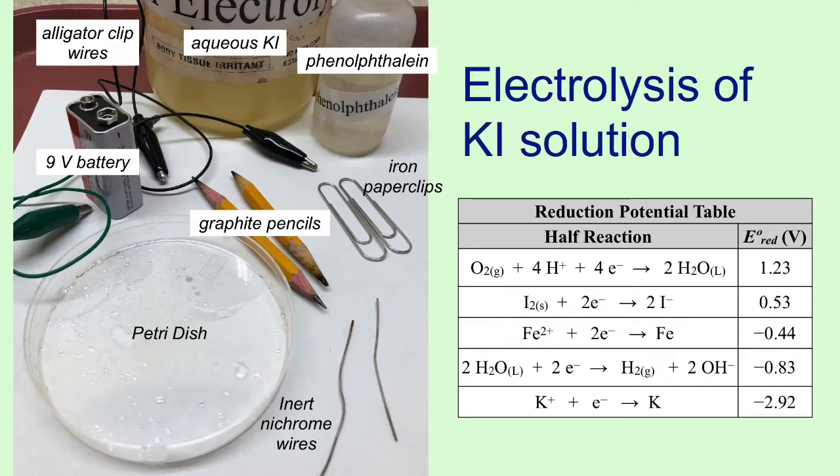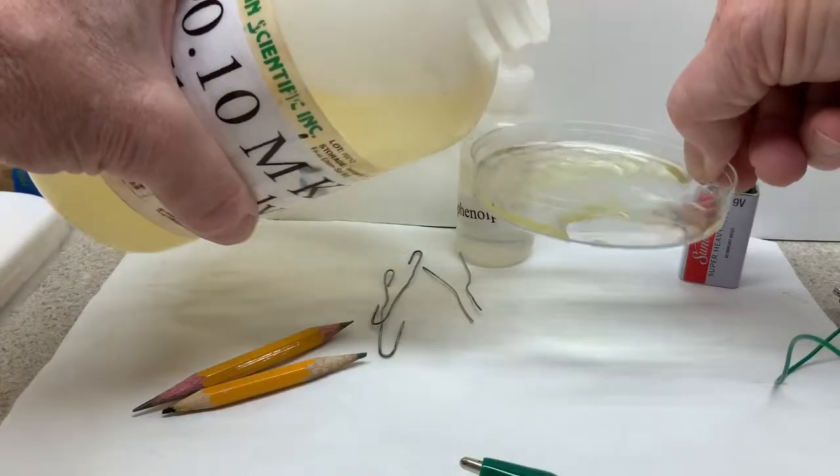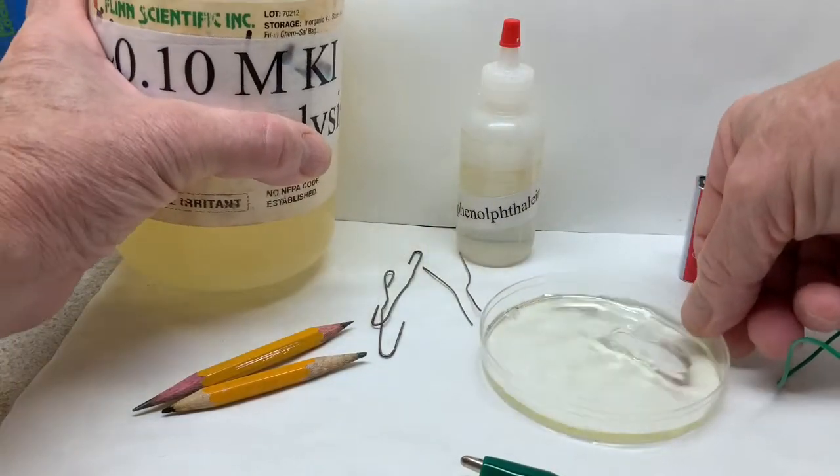This is lab B5, electrolysis of potassium iodide. Pouring a solution of potassium iodide into the dish.